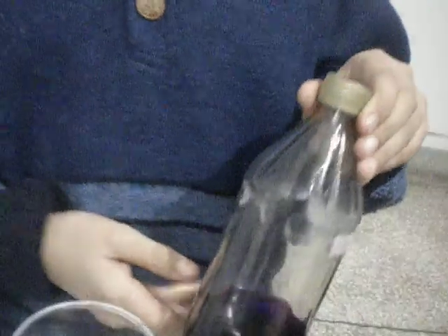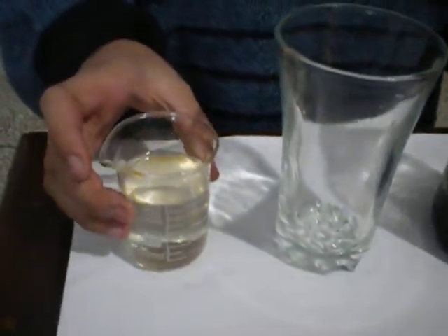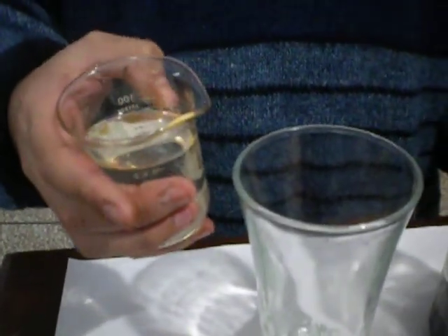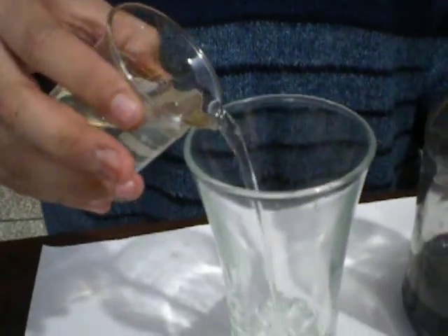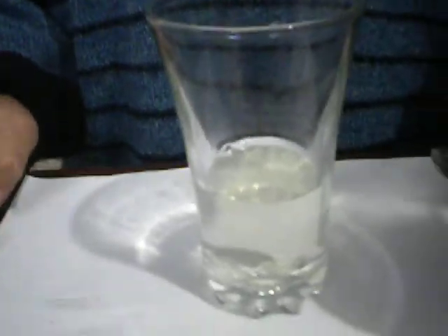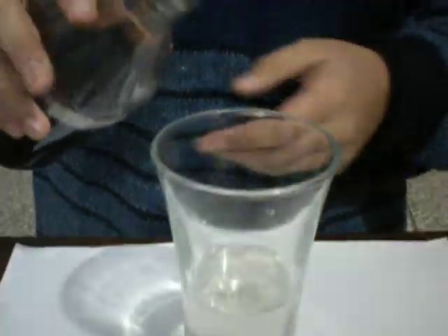potassium permanganate solution, and that's all. First of all, I will pour this sodium hydroxide plus water solution in this glass. Now very gently, as soon as I pour this potassium permanganate solution in this solution, the solution will change colors.